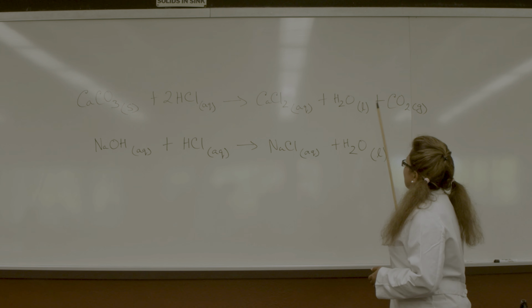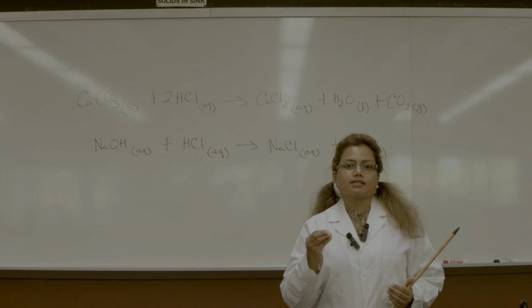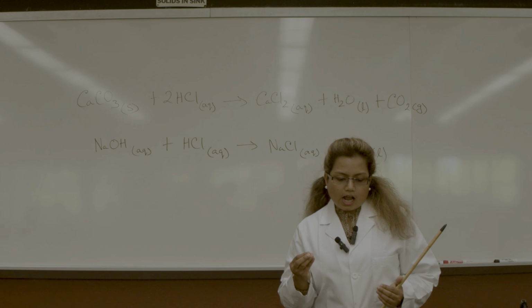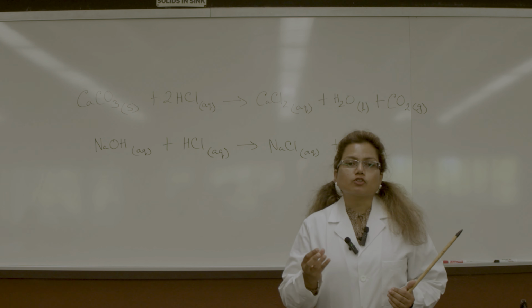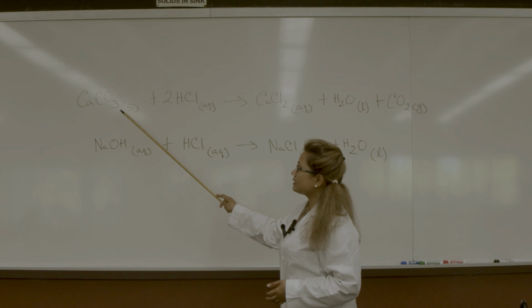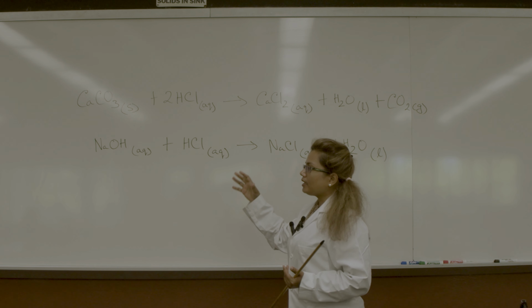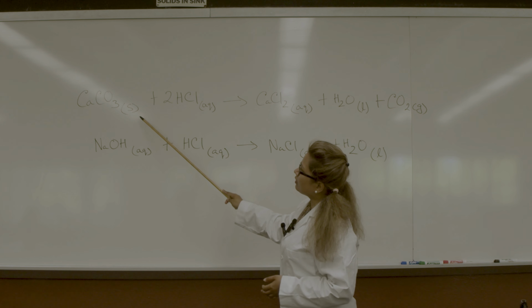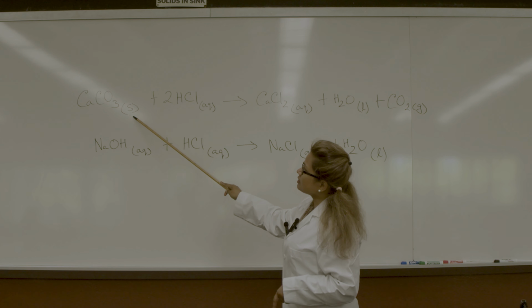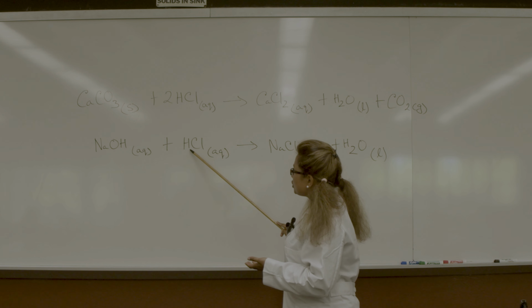In this experiment, we are using an excess quantity of hydrochloric acid. We are going to see how many moles of hydrochloric acid react with our Tums, or antacid, calcium carbonate. Calcium carbonate should be the limiting reactant, so there should be an excess amount of hydrochloric acid.